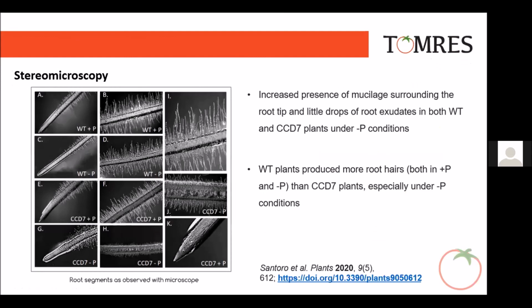Veronica got this nice work published in Plants last year, supplemented with nice microscopy images that showed differences in the mucilage surrounding the root tip, and also exudates on the root hair. Lovely images.